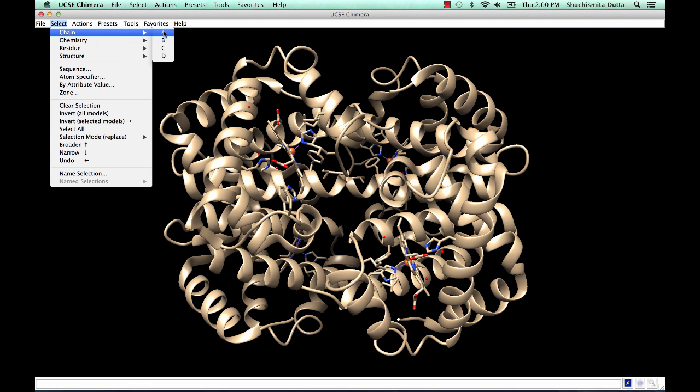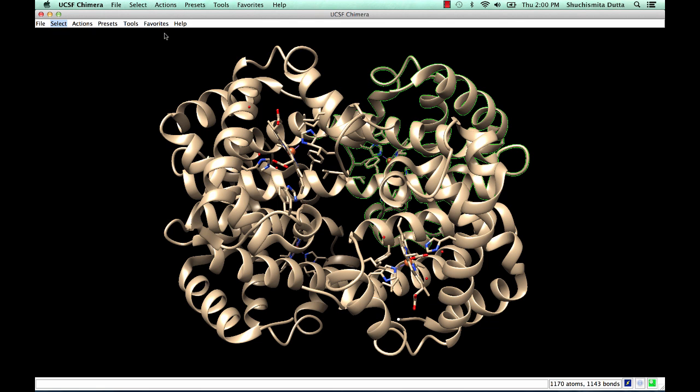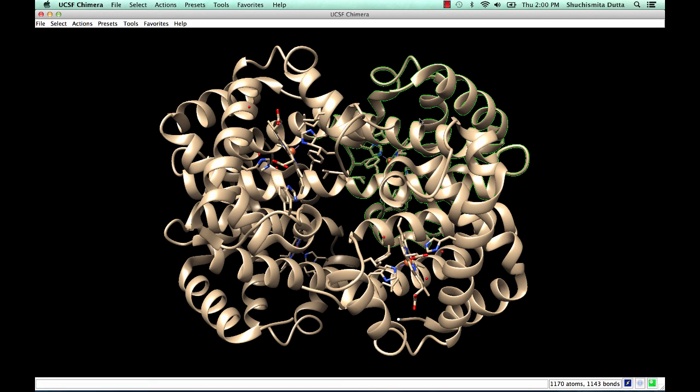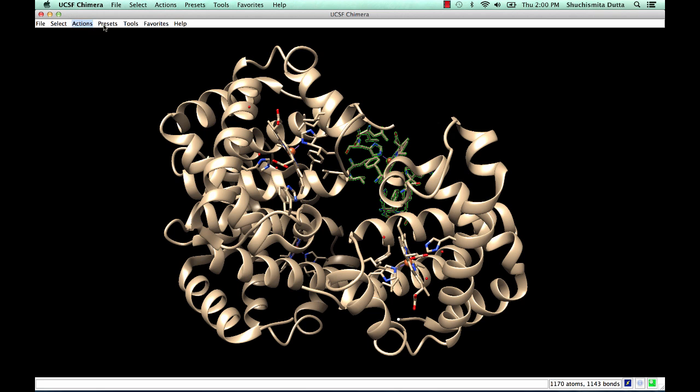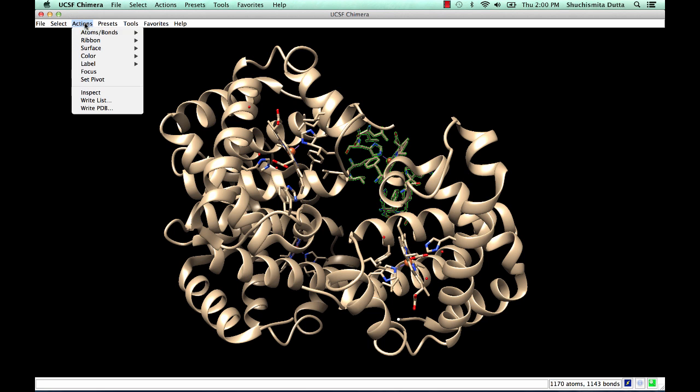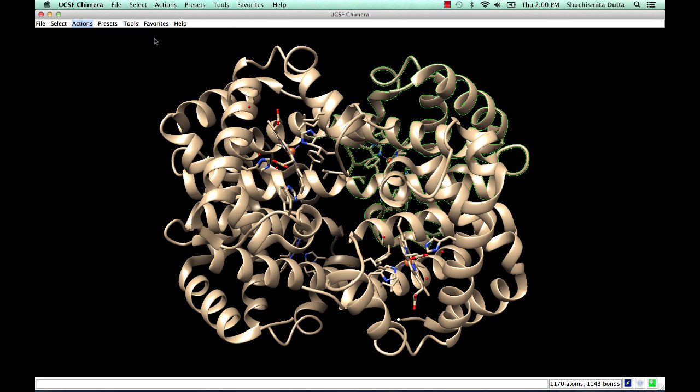For example, let's say we decide to select chain A. Notice that this particular chain now has a green halo about it, indicating that chain A is now ready to receive action commands such as ribbon hide or ribbon show.